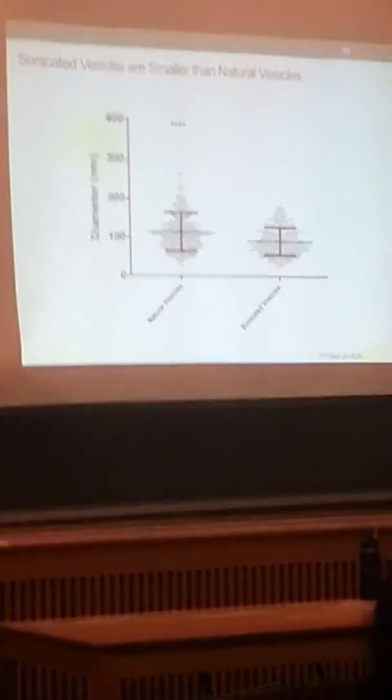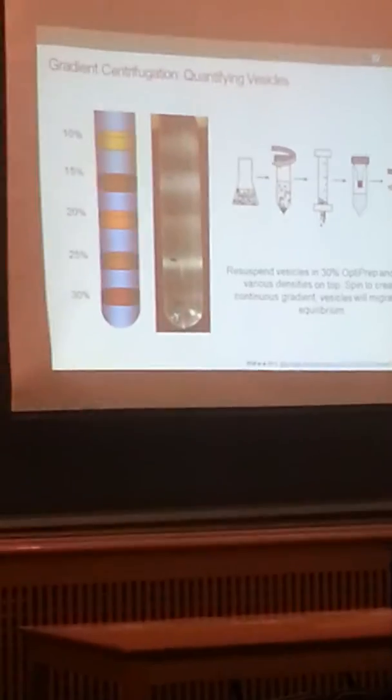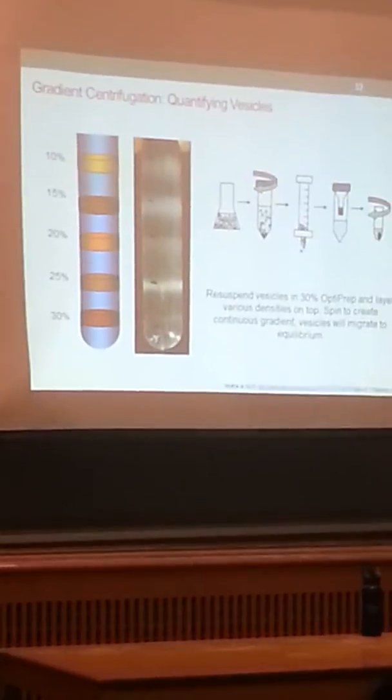And again, going back to wanting to try to quantitate these strains, one thing we can also try to utilize is the density gradient. This density gradient will also tell us how dense these vesicles are, which is a little bit of extra information. Again, I utilize radioactive vesicles, so I've labeled them the same way as before.